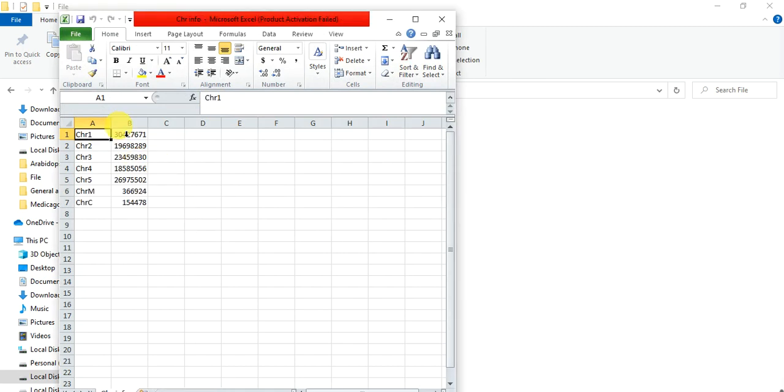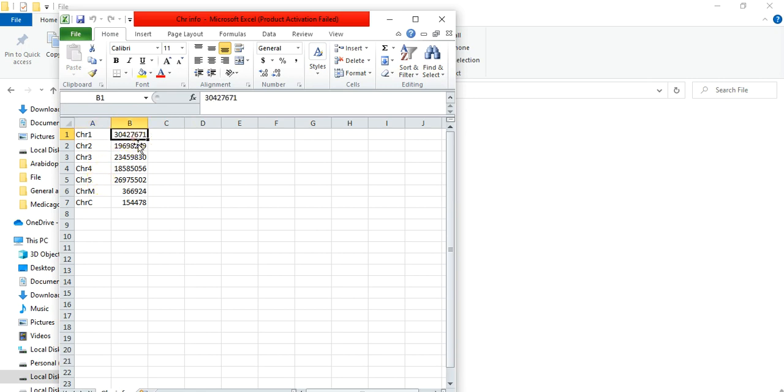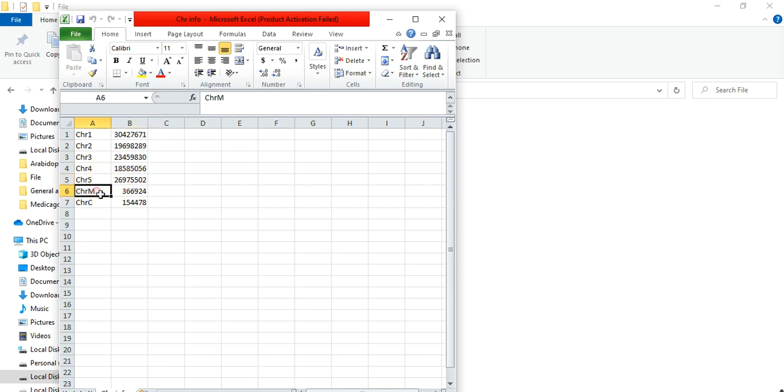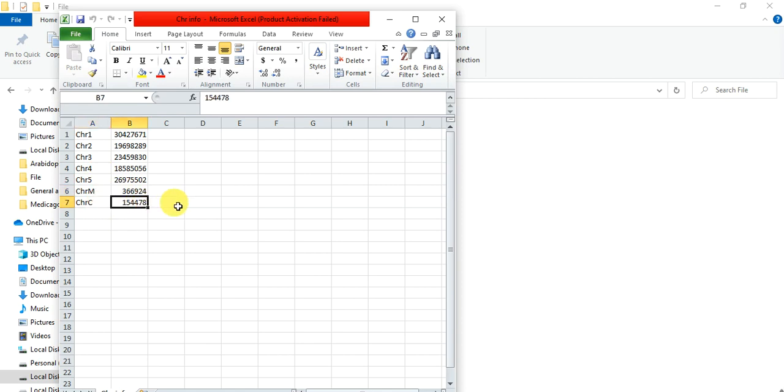So here are the information of each chromosome. There are five genomic chromosomes: chromosomes 1, 2, 3, 4, 5. And there is the length of each chromosome of that organism. And this is the mitochondrial chromosome and its length. And this is the chloroplast chromosome and its length. So in this way you can find the length of each chromosome and number of chromosomes present in any organism.